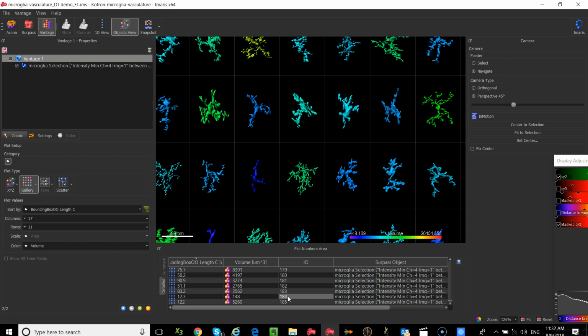But we're going to be setting up in the computer lab, which I believe is across the hall. So this is going to be more of a session where you get to follow along and see the workflows as to how we create structures and how we can pull out the statistics. But if anyone has any questions right now, feel free to ask.